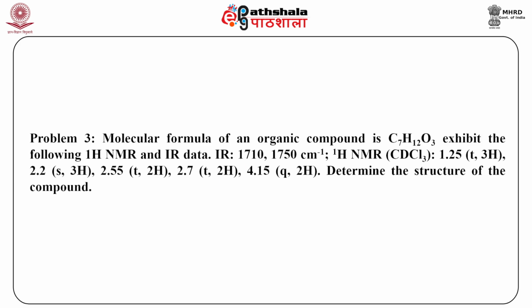Molecular formula of an organic compound is C7H12O3, which exhibits the proton NMR and IR data as follows. The IR data is 1710 cm⁻¹ and 1750 cm⁻¹. They have given only 2 peaks to you, students.